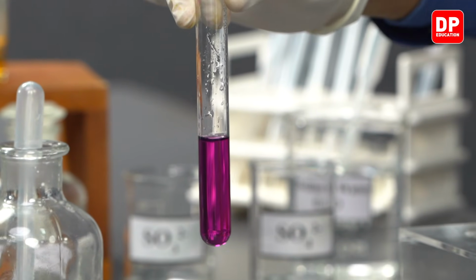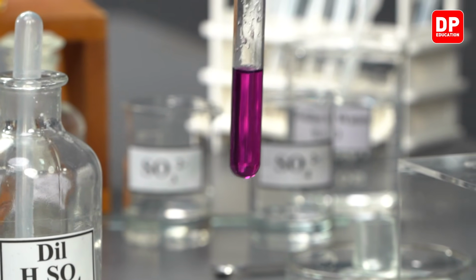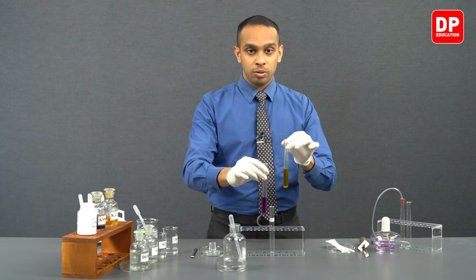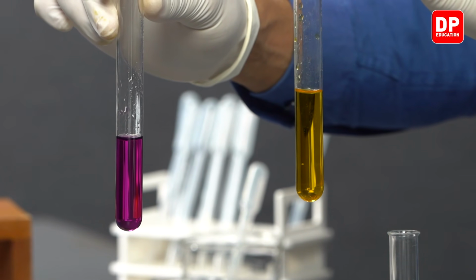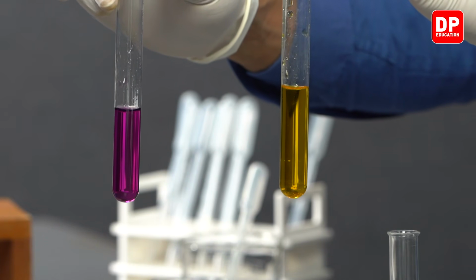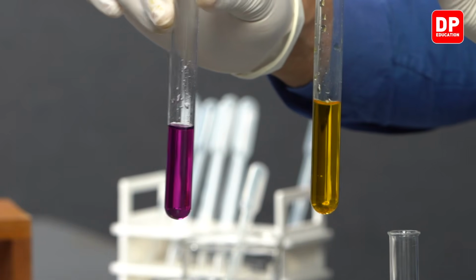So we have now prepared our acidified potassium permanganate solution as well. On my left, the orange color solution that you observe is our acidified potassium dichromate solution, and on my right, the purple color solution is our acidified potassium permanganate solution.